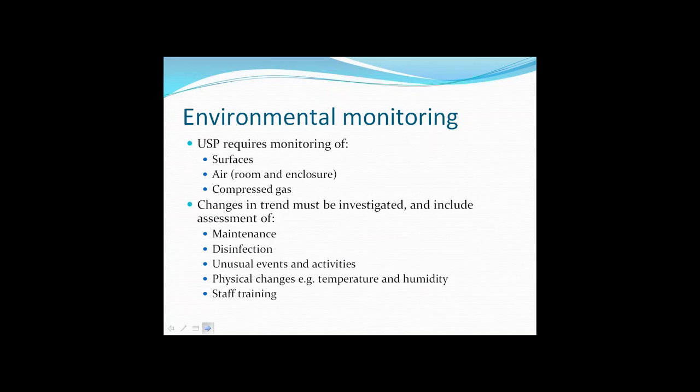With environmental monitoring methodology, the USP follows standard practice in terms of the methods listed. So it talks about the monitoring of surfaces with swabs and contact plates or the Rodac plate, the monitoring of air through active air samplers and settle plates, the monitoring of people through finger dabs and gown plates. So fairly standard, historically long-serving environmental monitoring methods.